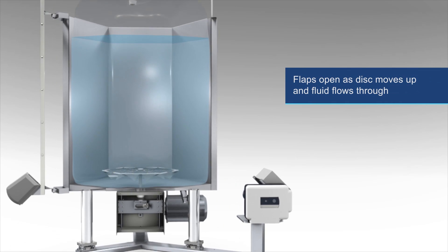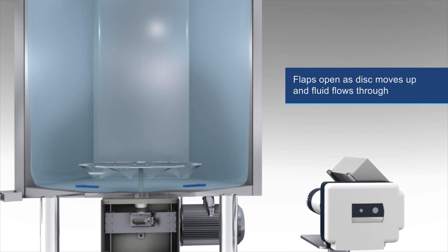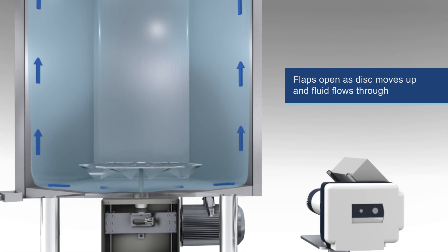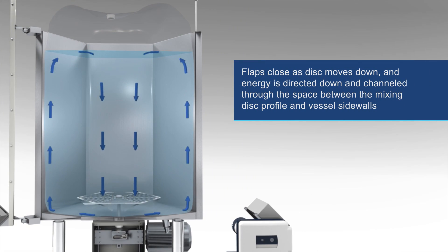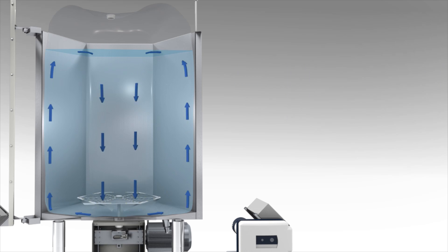The flaps open as the disk moves up from the bottom of the BPC and fluid flows through the slots of the disk. On the downstroke, the flaps close and energy is directed toward the bottom of the BPC and channeled through the space between the mixing disk profile and the vessel sidewalls.